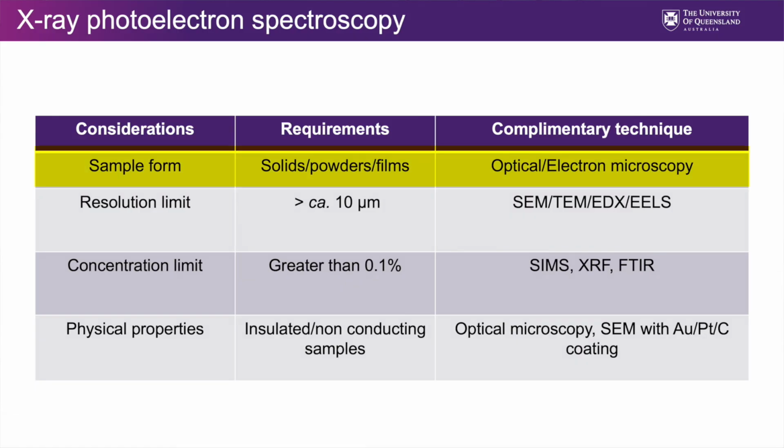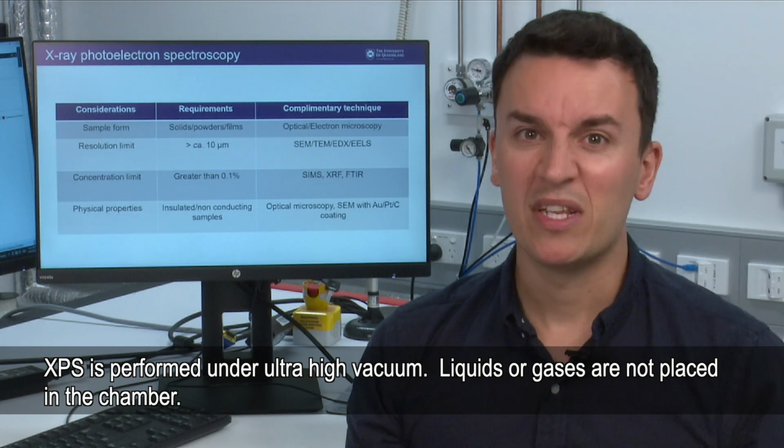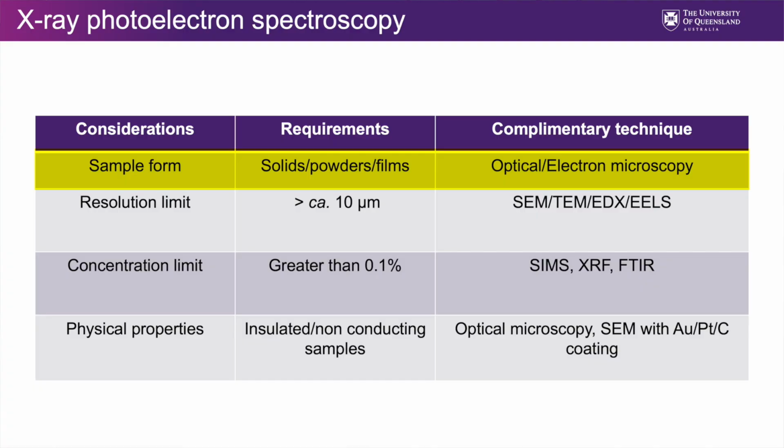For XPS, the sample needs to be a solid or a powder or a thin film. This is because it is a technique that's performed under ultra high vacuum, and so liquids or gases, we can't put these into the chamber. As a complementary technique, something like electron microscopy or optical microscopy could help you out.